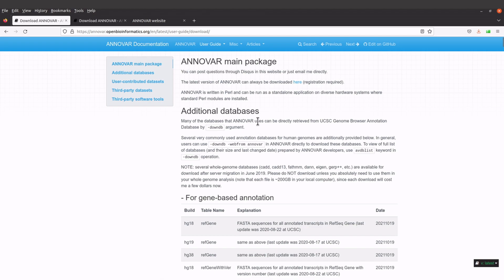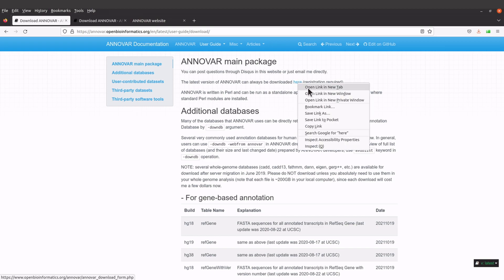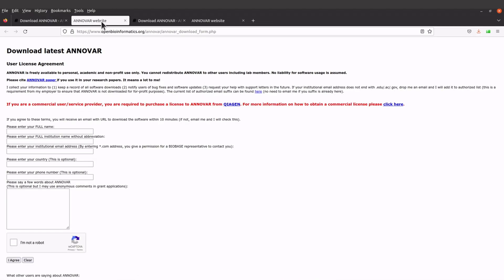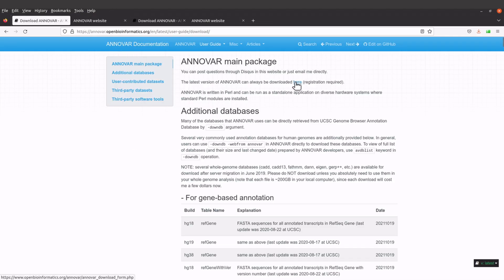When you are here, look for this text: 'The latest version of ANNOVAR can always be downloaded here.' There's a link that has been embedded here, so just click it. I'll open it in a new tab — you can also click it straight away.